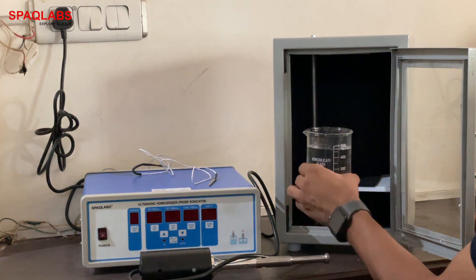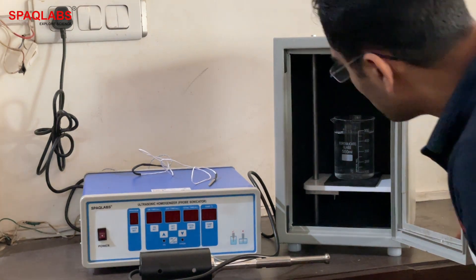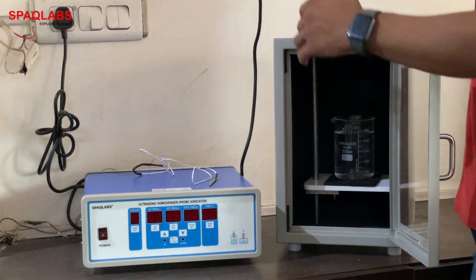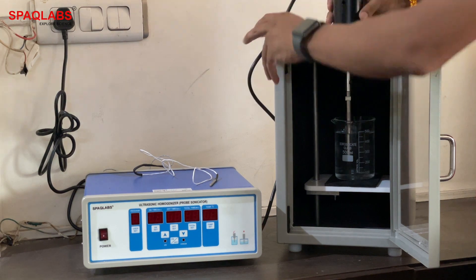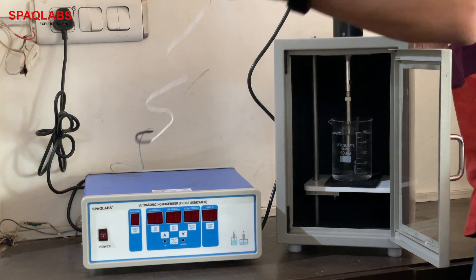This is our sample. We will now insert the probe from the top. This here is a temperature probe.